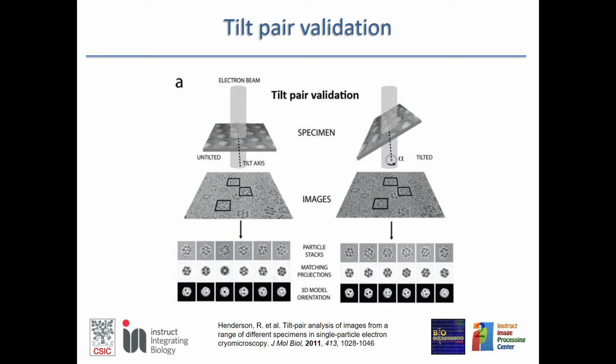From the image processing point of view, we can take all the images and compute a volume, or we may take the mirror of all these images and compute a mirrored volume. And from the structural consistency, the volume is consistent with the images, only that they have been flipped.